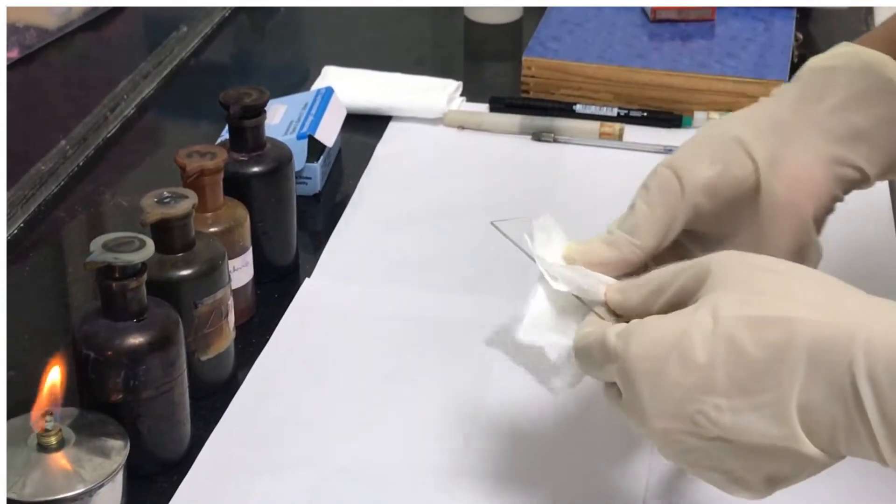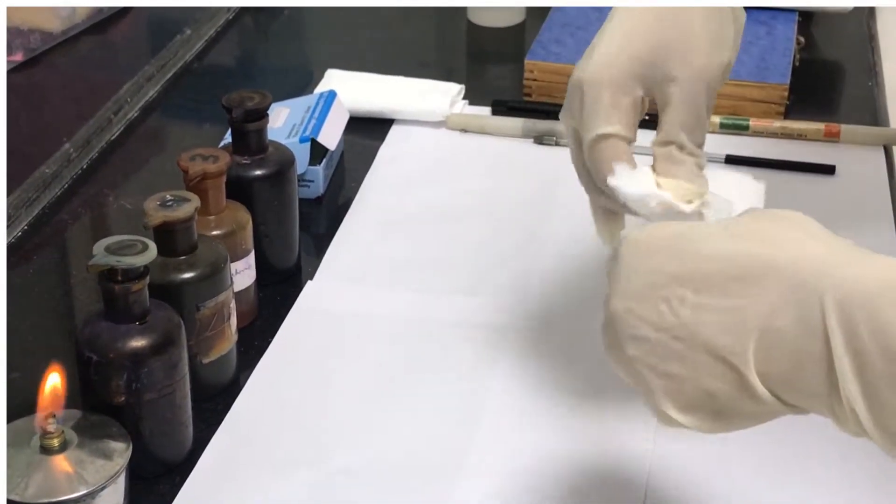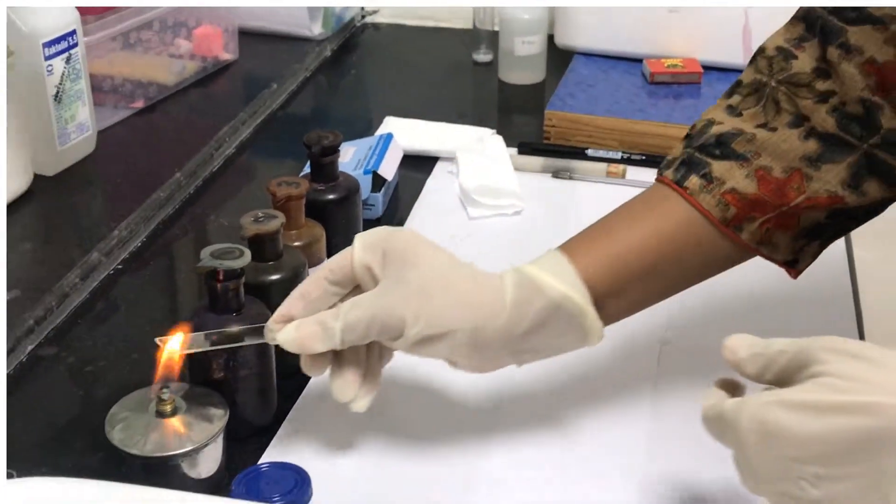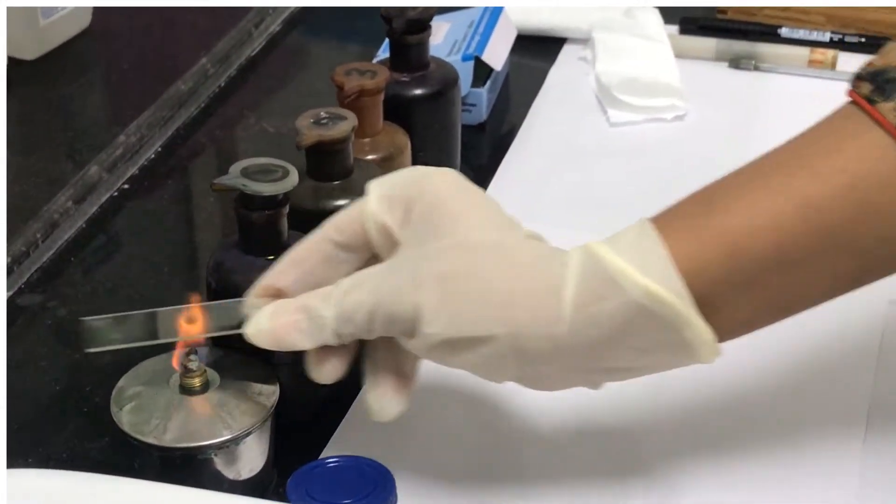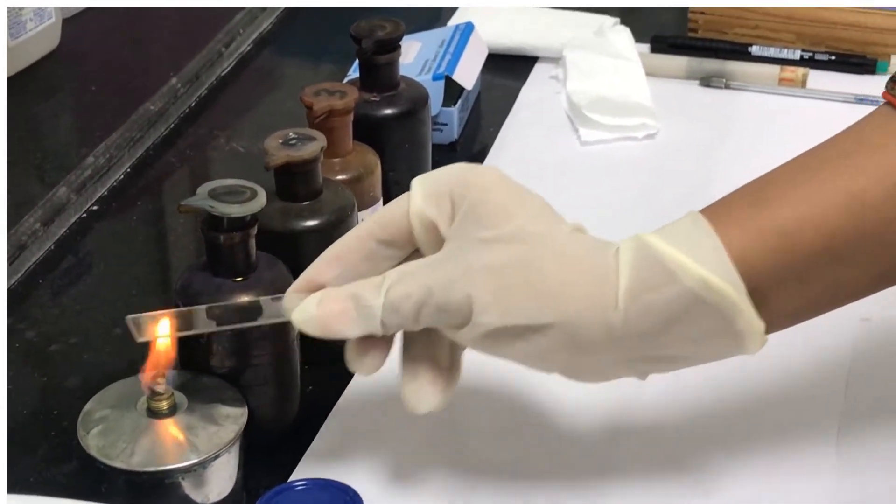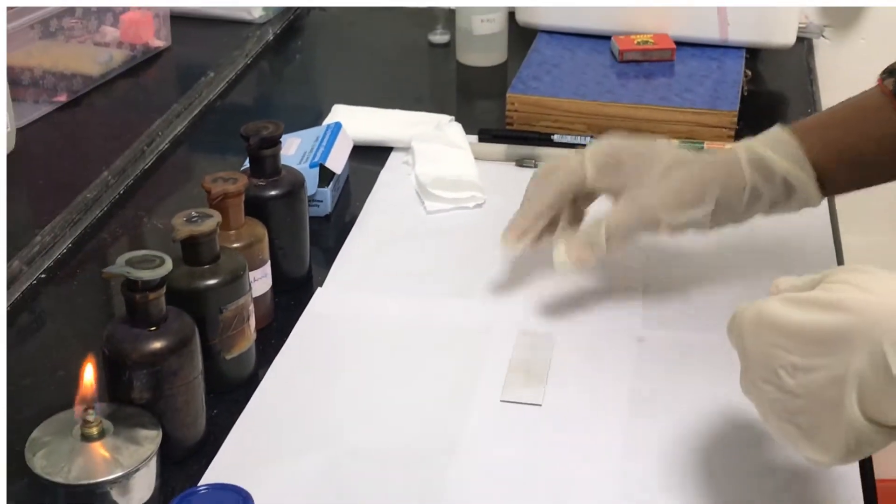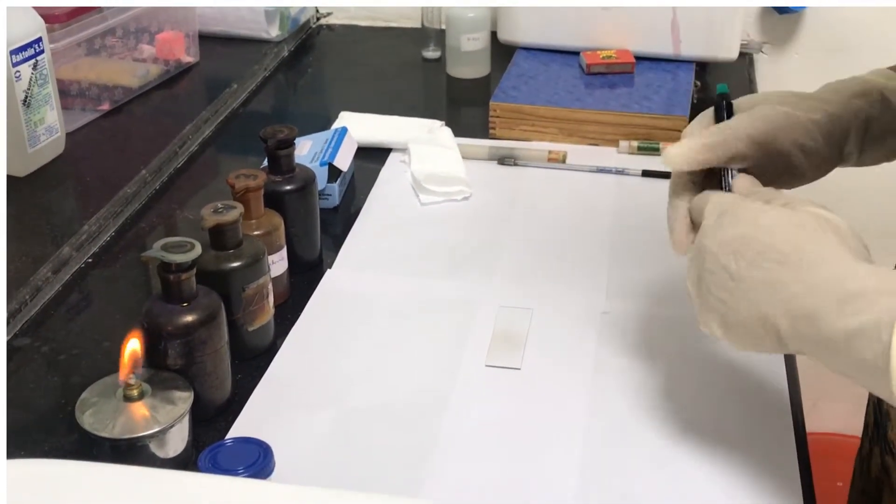We clean the glass slides with blotting paper and make it sterile by passing it through the Bunsen flame three or four times, then label the slide by drawing a circle using a marking pen.